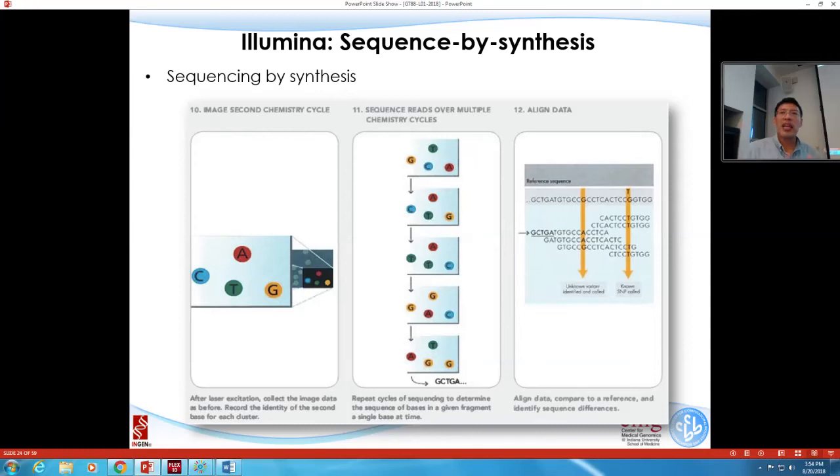And they did this while making sure that the quality of the sequencing was not sacrificed. The second innovation they did: I'm showing you a flat surface, but they are actually not flat surfaces anymore. The initial version was, but later they put in little holes, so this is actually many holes. Each hole only has one nucleotide fall into it. By that, you can pack your sequences in a denser format, because you can place them where you want them to be. And you also don't need to do the cluster identification, because you already know where to search.